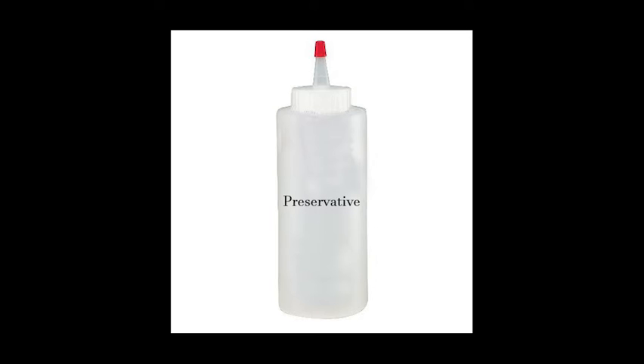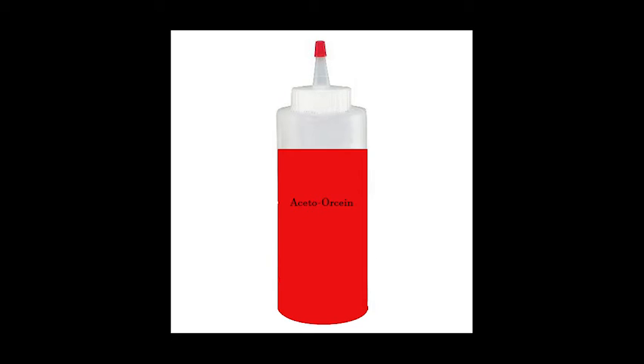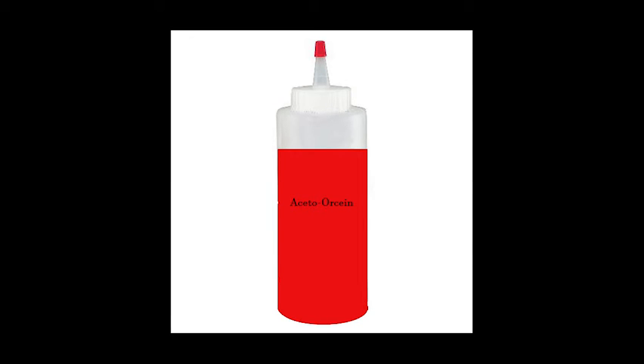Cover the root tip with two drops of preservative for five minutes. Drain the liquid from the slide using a paper towel. Keep this liquid off your skin because it can irritate your skin. Cover the root tip with acetoorcine stain for 20 minutes. Make sure you keep track of the time. Drain the liquid from the slide using a paper towel.